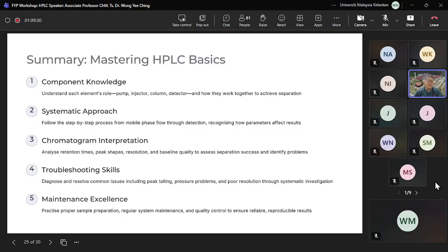This is why in one day we cannot run a lot of different types of sample, because we need to do maintenance in between different samples. That's the reason why it takes quite a lot of time and effort from the assistant.